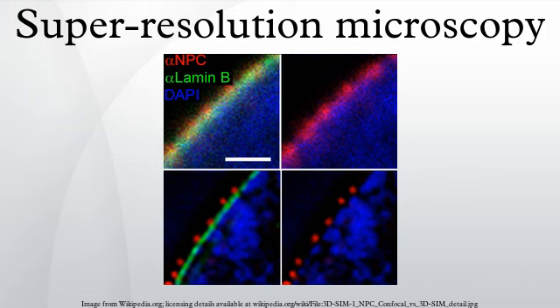Deterministic functional techniques. RESOLFT microscopy is an optical microscopy with very high resolution that can image details in samples that cannot be imaged with conventional or confocal microscopy. Within RESOLFT, the principle of STED microscopy and GSD microscopy are generalized. Also, there are techniques with other concepts than RESOLFT or SSIM, for example fluorescence microscopy using optical gate property of nitrogen vacancy center. Stimulated emission depletion, or STED.